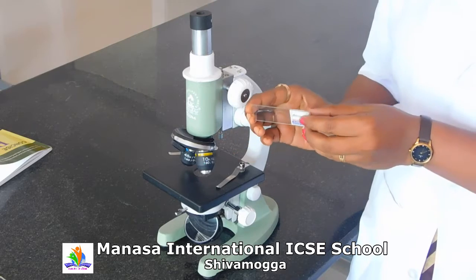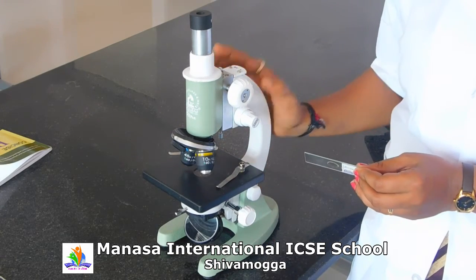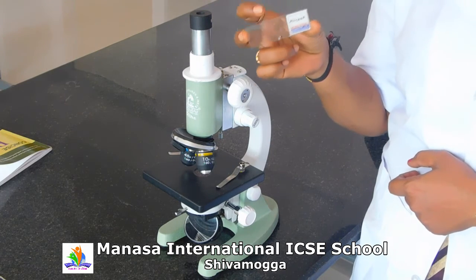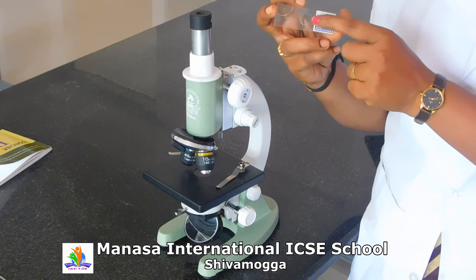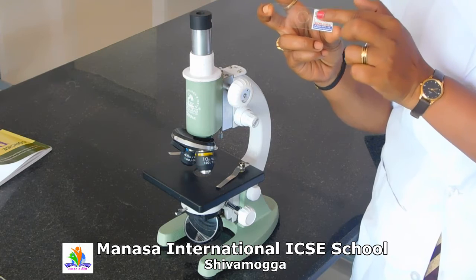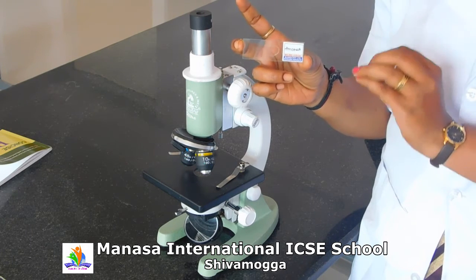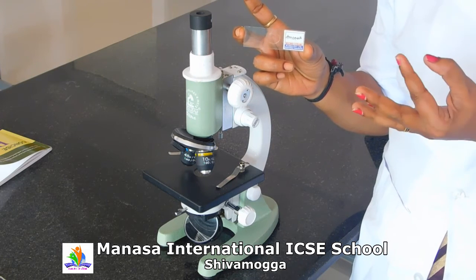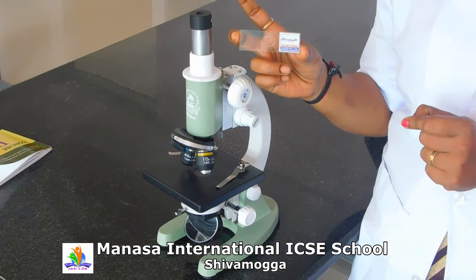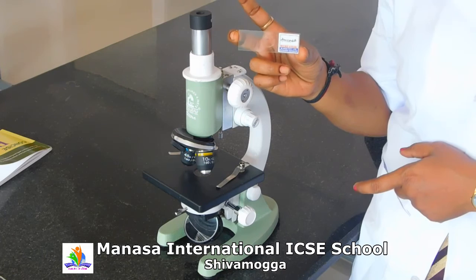So this is a complete compound microscope which we use in our biology lab to observe the minute slides. See, these are all the permanent slides. They take the material and they just place it on the slide, and they'll be preserving it for longer term. For example, you can observe unicellular organisms and some of the parts, dicot root, monocot roots, leaf, so many, right?